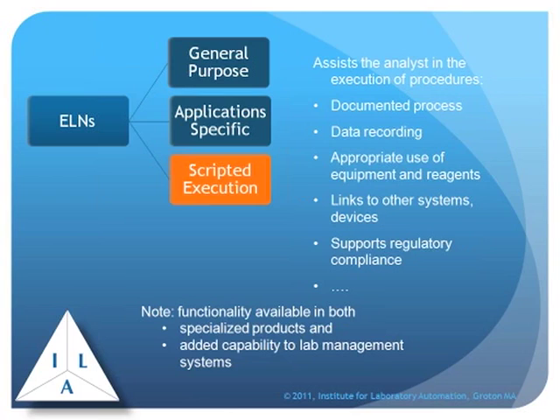The functionality that's available in laboratory information management systems is quite a bit different. It provides the direct links to everything in the LIMS system, so all the data you need to work with is there. But they're a bare-bones system. You have to do all the programming. So it's a trade-off as to where you want to spend your time and your efforts.